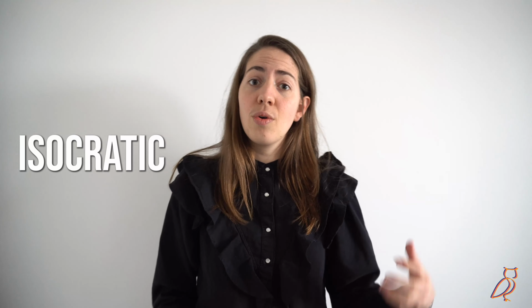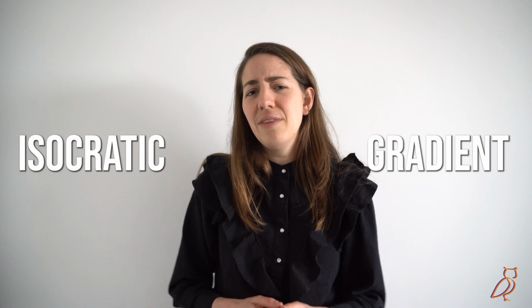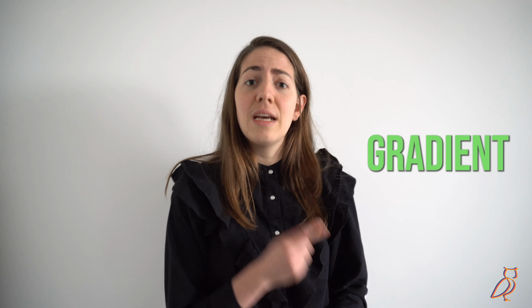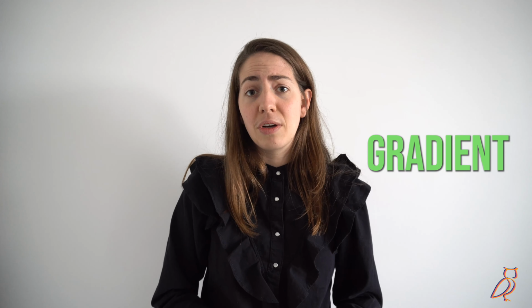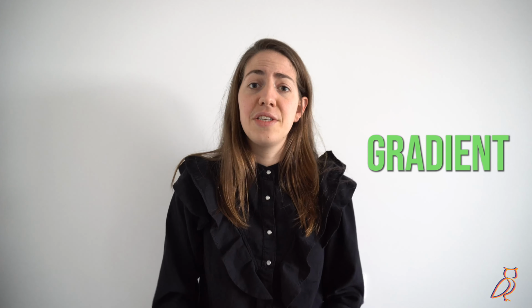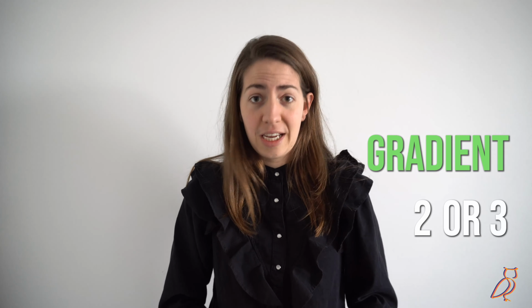The first question could then be, do I do isocratic elution or gradient elution? While many of these models have been validated with isocratic elution, gradient elution actually guarantees that your compounds will elute from the column and thus produce usable data. For that reason, I suggest that you measure 2 or 3 scanning gradients.